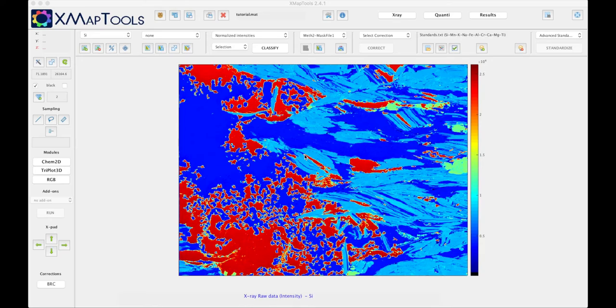Welcome to this XmapTools tutorial. Today I'm going to show you how to use the new standardization function introduced in XmapTools 2.4.1.